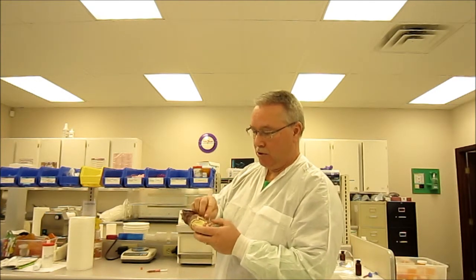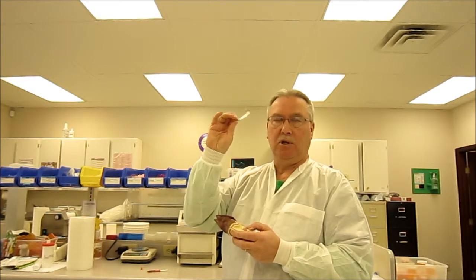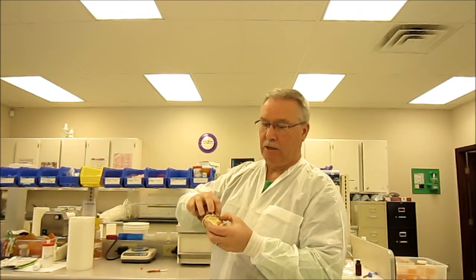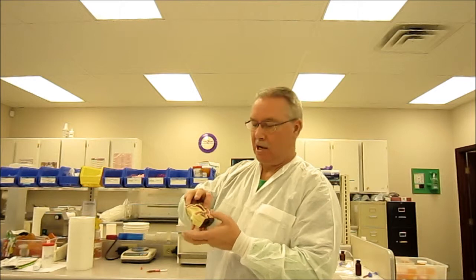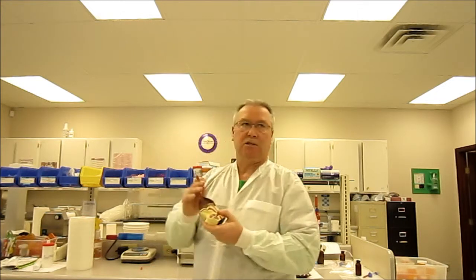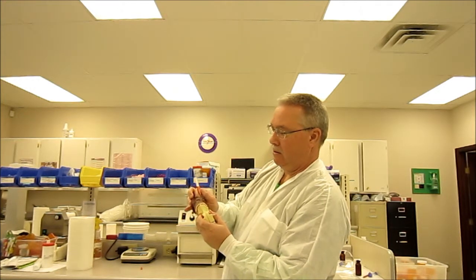So I want to show you, I just use tubing from an inhalation unit that's used for a nebulizer, cutting it into strips that fit into this model. The model we got at anatomynow.com. I think it was $65 for the model. And with the tube in there and a syringe of the medication, I can just demonstrate exactly what we're dealing with. So I'll just stick that in here.